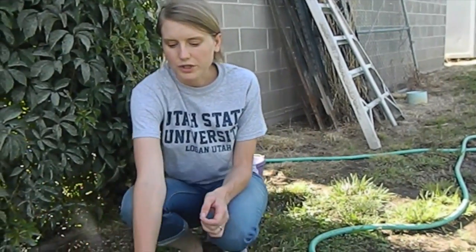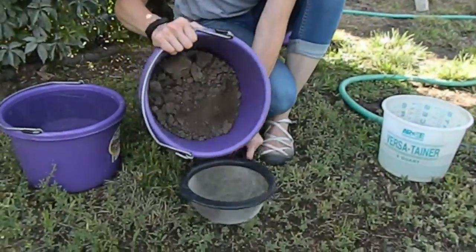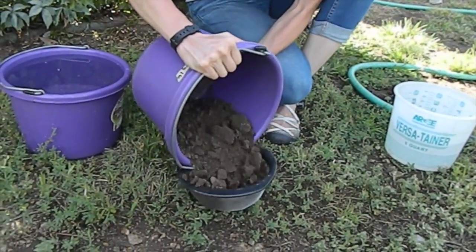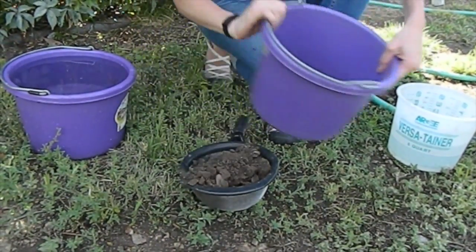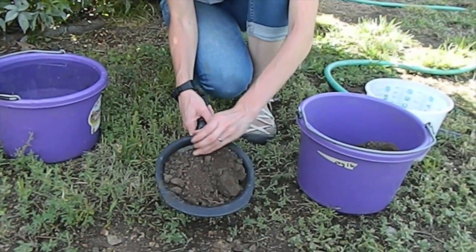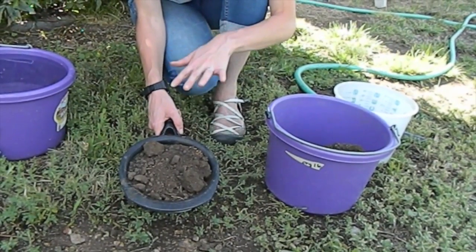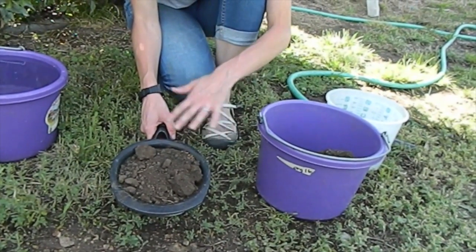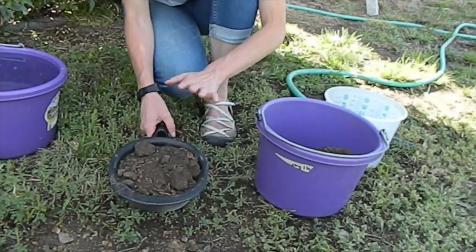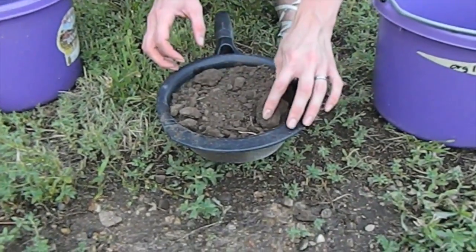When filling, you want to fill your sieve with the soil and make sure that it's up to the rim. Once that's done, you'll want to take a picture of your soil just so you know what it looks like before you start dunking it.